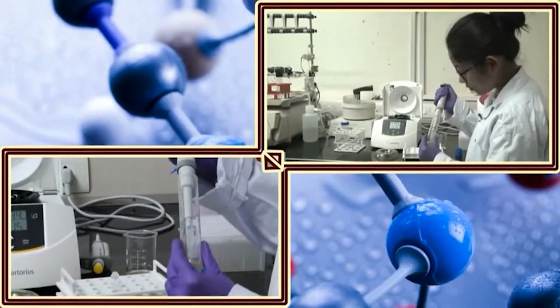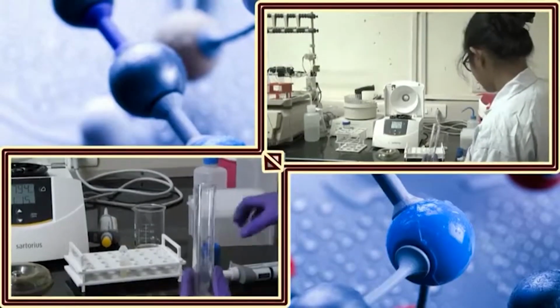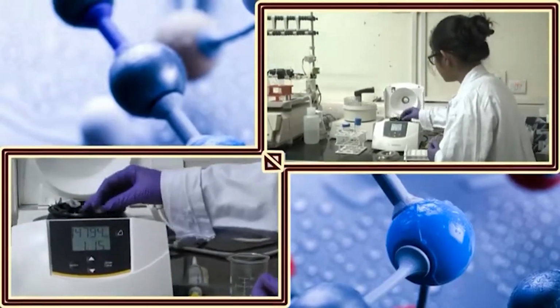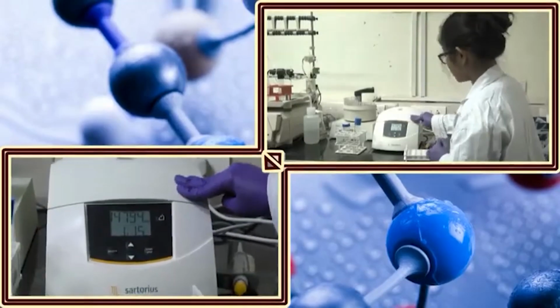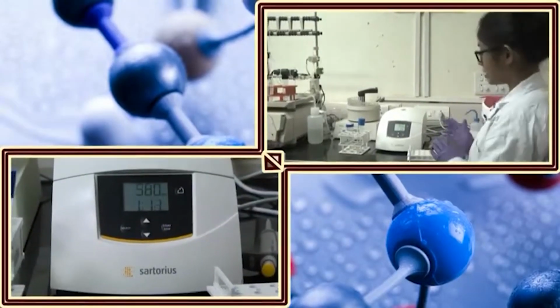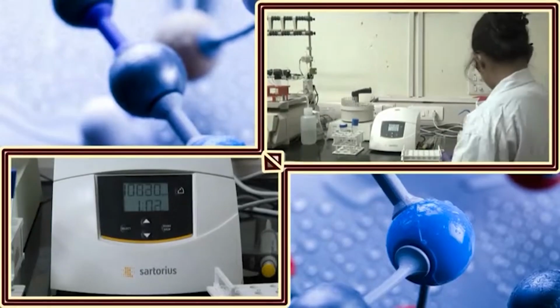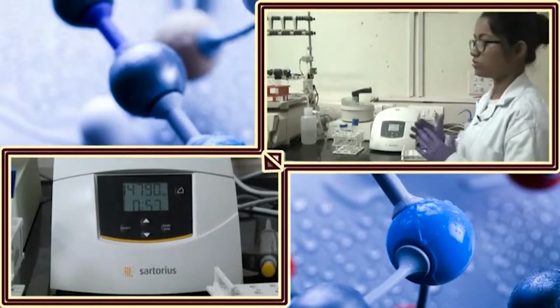So, I am taking almost 1.2 ml. You do not need to be very precise about this, because anyway we are going to take all the cultures present in this. So, I am not changing the balance, because I took almost the same amount as previously. Always remember to put on the lid, close the rotor and again start, and always keep an eye. If the machine is making any kind of noise or showing errors, immediately stop the centrifuge machine. So, now again we have to wait for another 1 minute, and in the same tube there will be another 1 ml, so all the cells will be in a pellet.